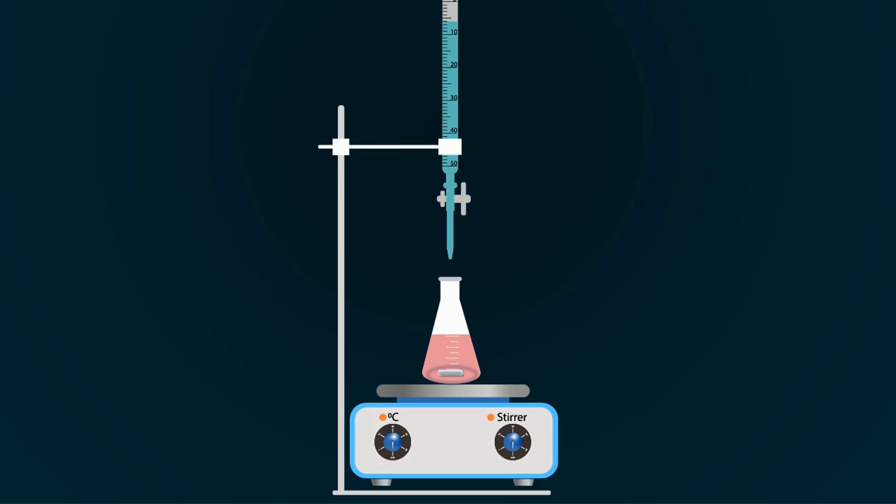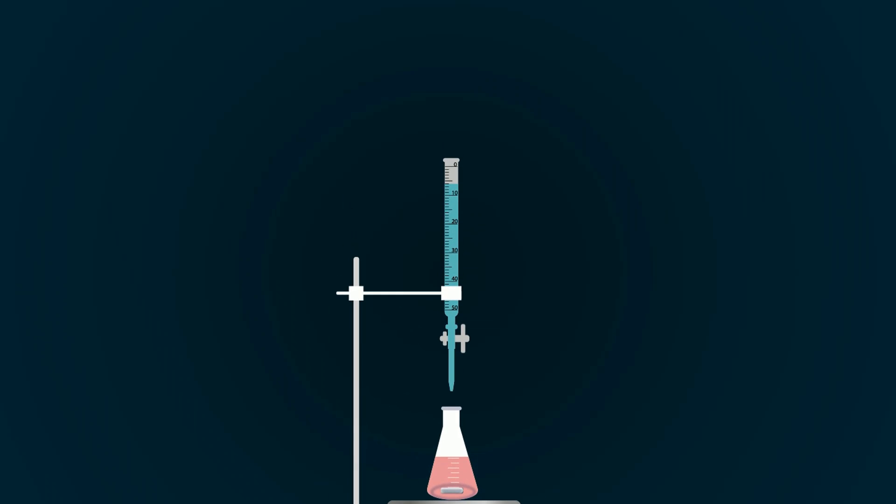Now stop the titration and you have to find out how much titrant is used. In this situation it's 6 milliliters.